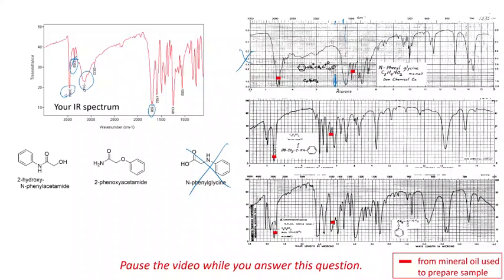Of the next two, if we look closely at this region here on the left in the NH and OH region, we see two absorptions, and that might suggest that we're seeing an NH and an OH, but there are two H's on the NH, so that is actually not definitive. Looking further, how do we match this 1698?